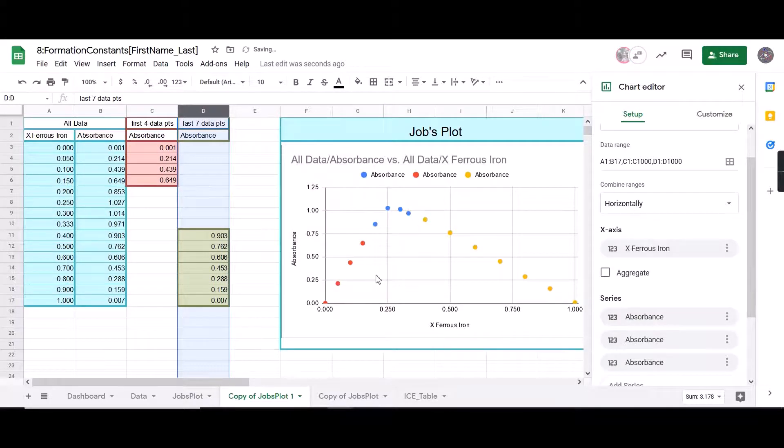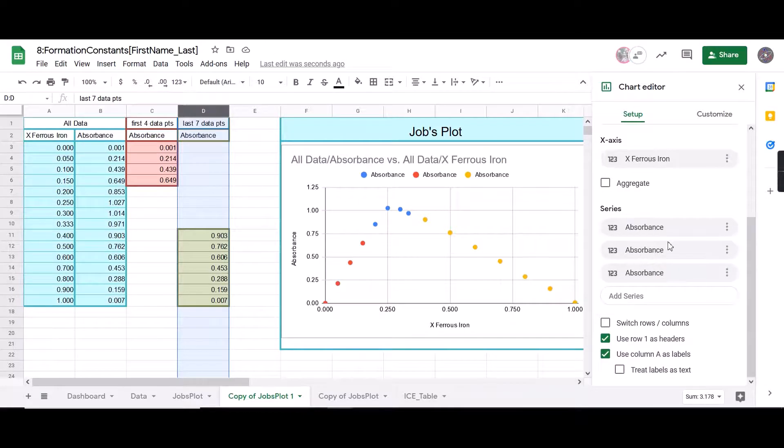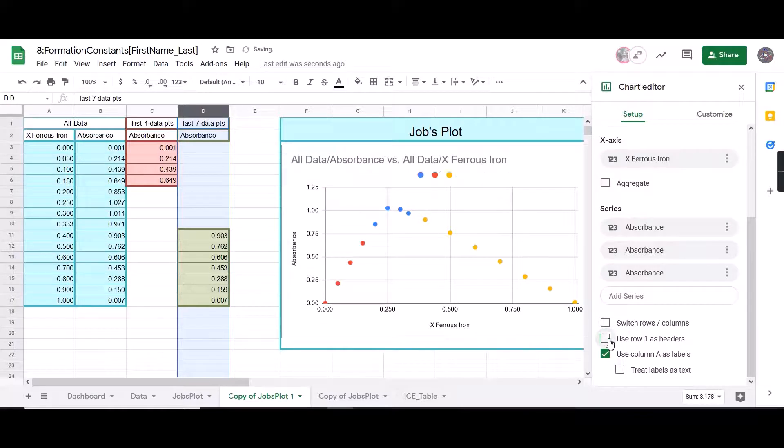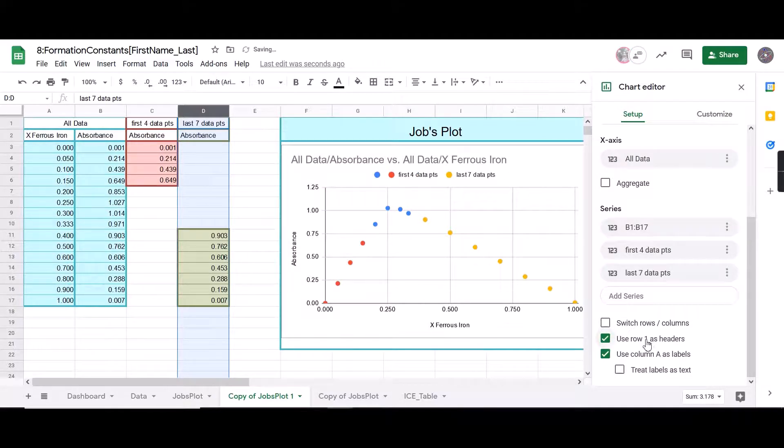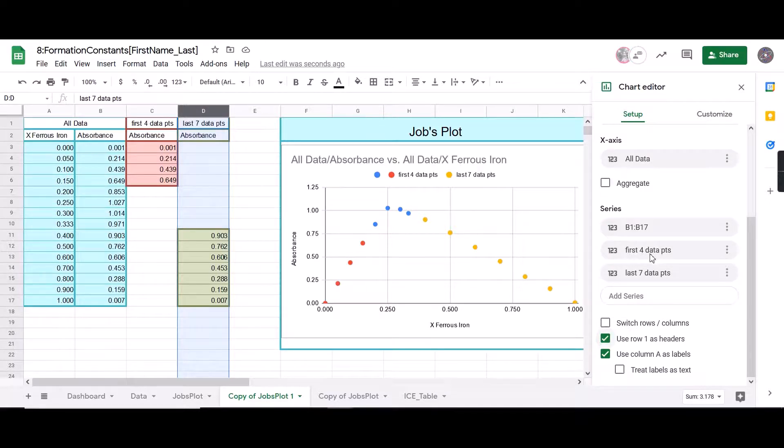So now you can see our very nice data points, except our series labels got a little bit messed up. This happens sometimes. I found if you just unclick and re-click, use column, use row, what is headers, that fixes it. And it's labeled as the first four data points and the last seven data points.